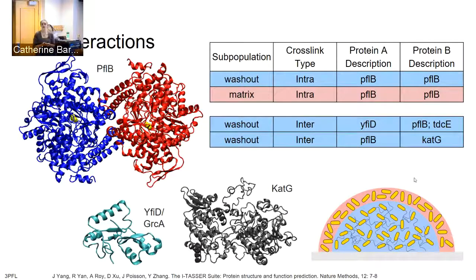Rosetta is not for MD, so why are you equilibrating? So just to get it out of the crystal structure. For the I-TASSER ones, it might not be necessary, but for ones that are actually crystal structures, I definitely want to let it equilibrate so that it's more relaxed. So when you run Rosetta, do you make it rigid body docking or flexible docking? That's a good question. And also, if you are using Rosetta, you should not use MD to relax it. You should use Rosetta's own relax program so that the energy is compatible.